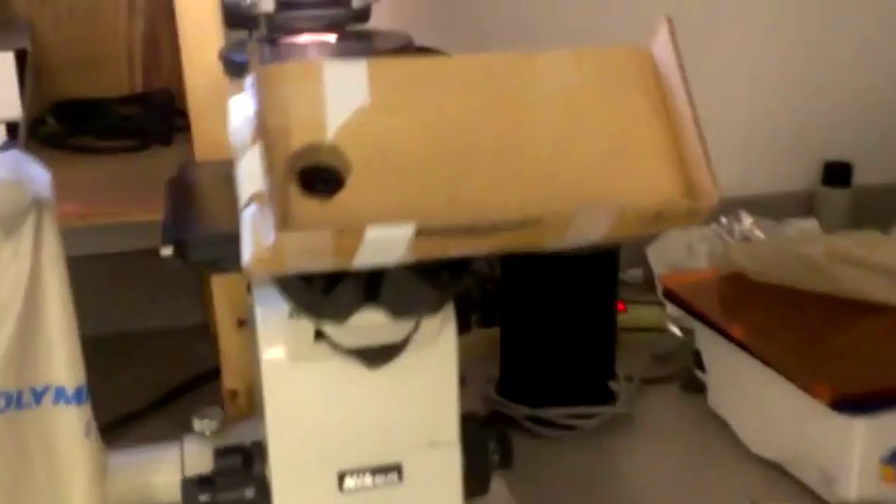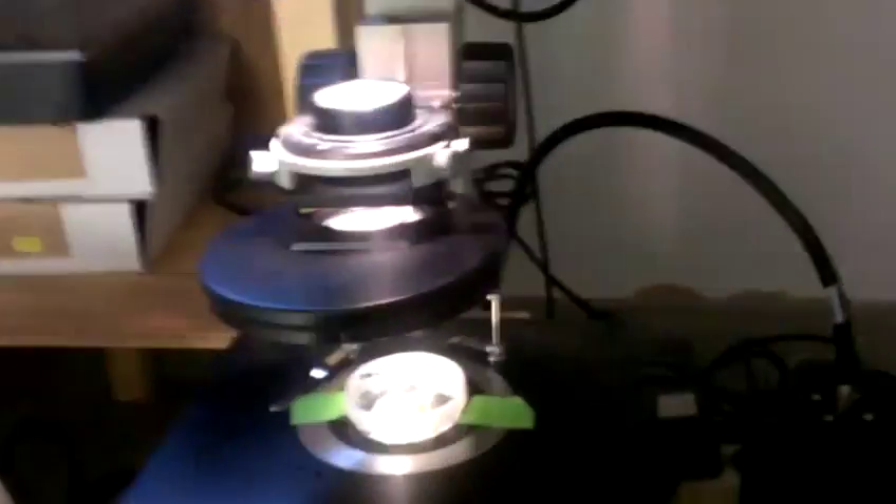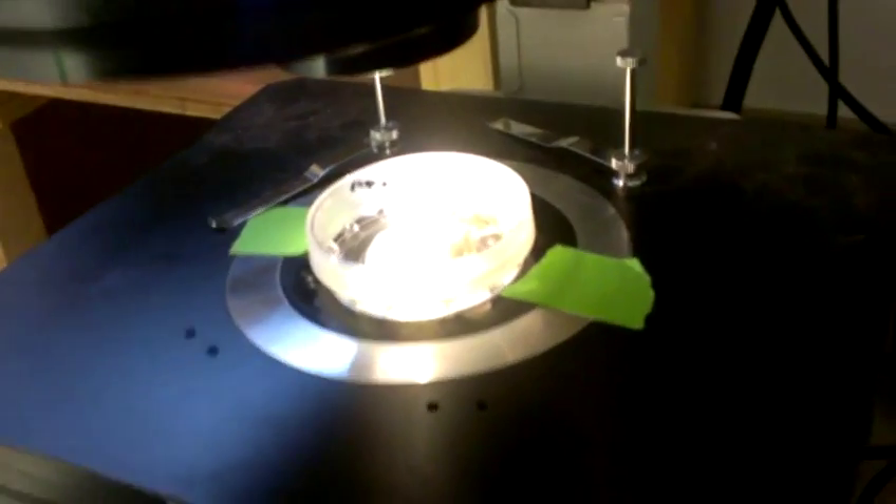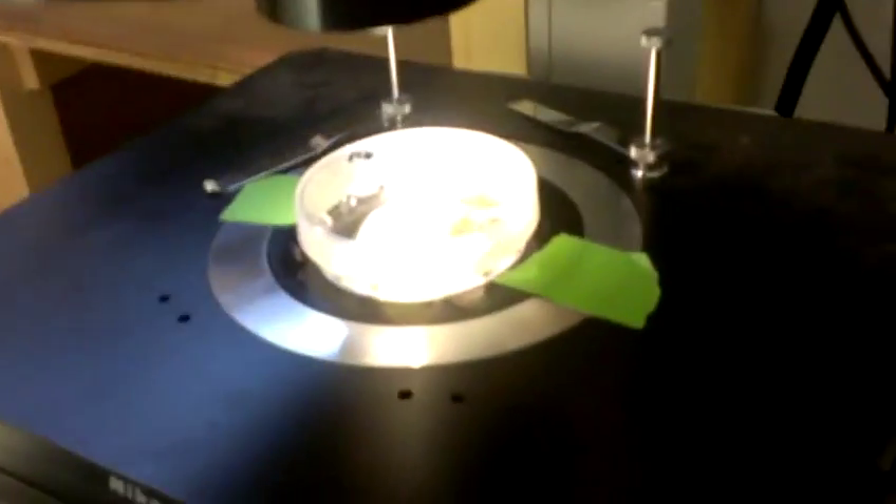But if we go over here to the microscope, you can see there's a plate on the stand there. And we can look at this rig that I made.